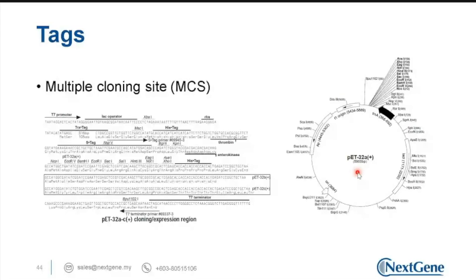Promoter, which is the T7 promoter. A lot of times we need the element ribosome binding site as well. Therefore, our protein coding sequence is after the RBS. You can see from the illustration here, we only see the protein coding sequence; methionine, the first amino acid, is right after the RBS. So when we're choosing our cloning site, for bacteria, it should be after the RBS.